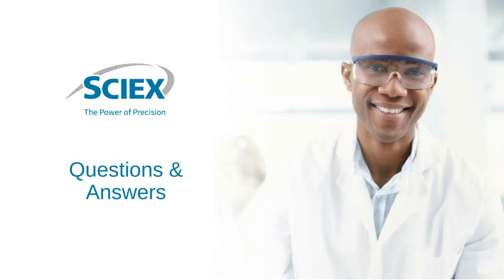And with that, in our hands, we were able to demonstrate the method validation that includes LOQ, LOD detections, and the linearity with different concentrations and different voltages for the same sample analysis, different temperatures, all within one sequence. Before, I would say that required probably 2 or 3 overnight sequences. Right now, you can do it in one setup in an overnight sequence.